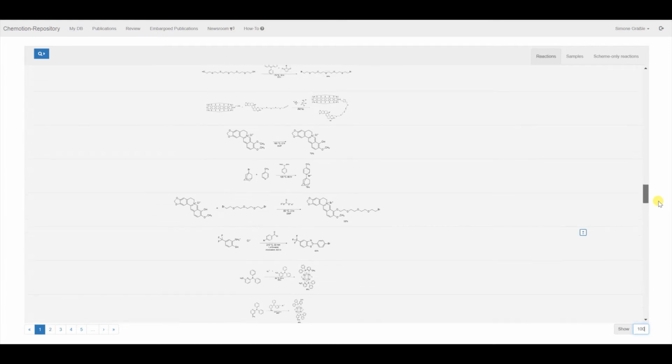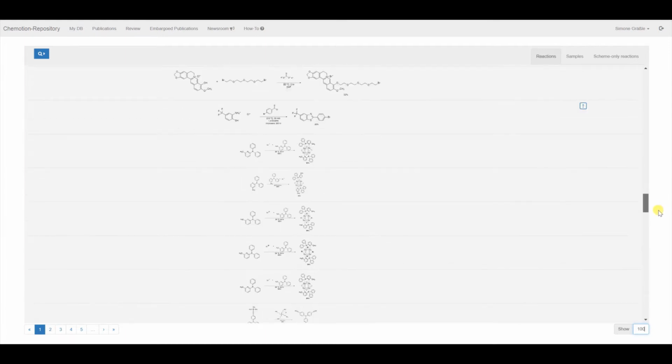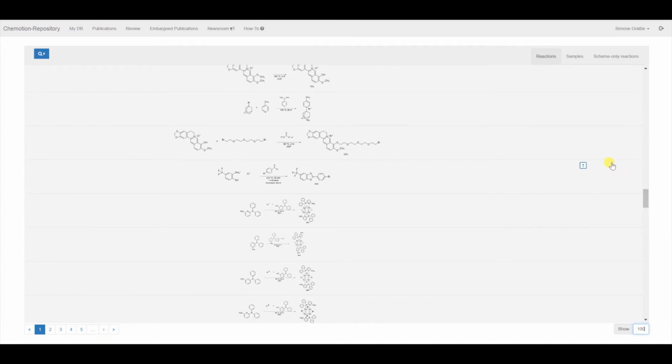Scrolling through the results of the published elements, you see here some symbols representing glassware, so an X vessel as we call that, and that's indicating that the digital entry in the repository has also an equivalent as the physical material. So we store the physical material, if desired, also in the compound platform, and that's available if the scientist is interested to use the compound for other tests or biological applications or something like that.